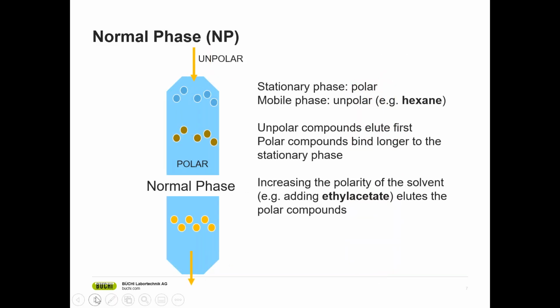The polar properties of a sample or compound to be separated direct the choice of the adsorbing material. The most appropriate stationary phase as well as a satisfying mobile phase should be identified by means of small-scale runs on analytical TLC. This method does not require too much time, is relatively cheap, and consumes very little of the sample. So TLC plates can usually be found with the same adsorbent as the column filling material.